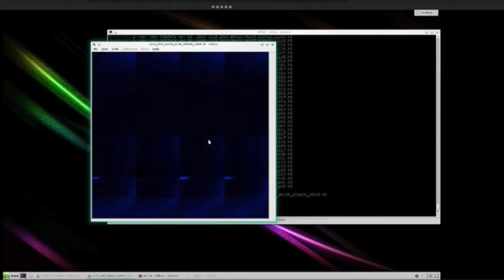You can see it doesn't make sense as a real image. So here we see the panels as they're laid out in the data, which is not the same as the physical layout. So CrystFEL uses a thing called a geometry file to tell it how the contents of the HDF5 file relate to reality. I have one already, so I'll probably just close this.